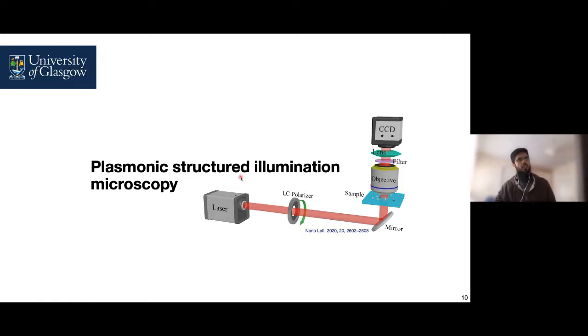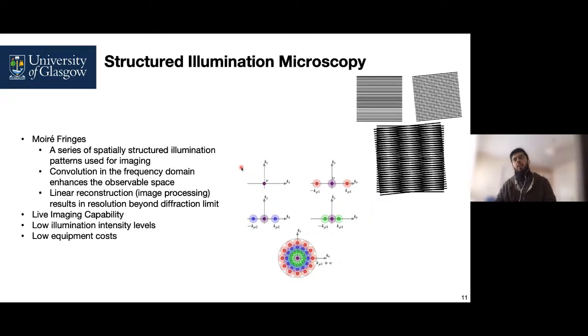In structured illumination microscopy, rather than having a uniform illumination, we illuminate the sample with a patterned illumination, and this pattern is changed in multiple exposures.